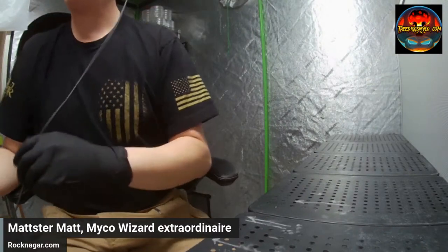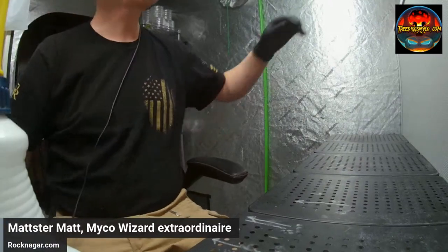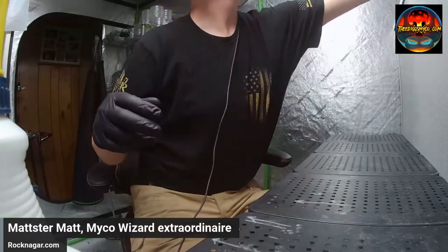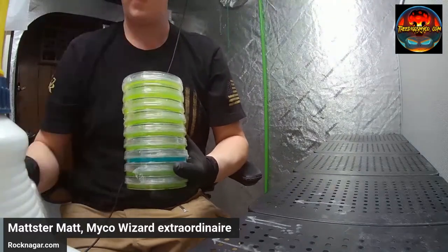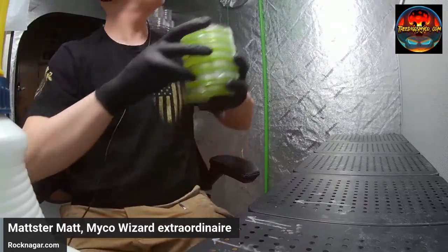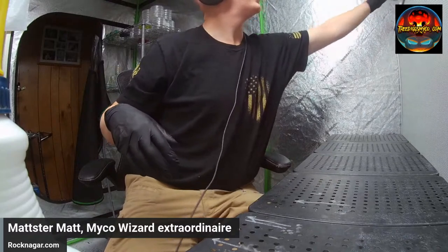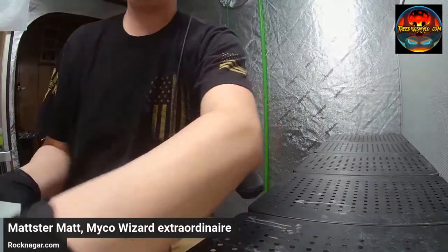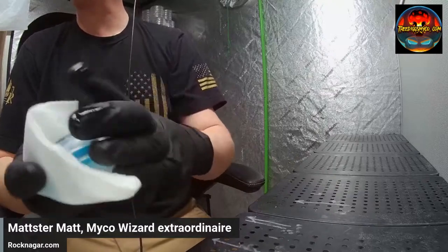All right, so we're going to go ahead and start out by doing some of the similar things we were just doing. I'm going to clean off some Petri dishes. See what we got to choose from here. We'll see how much time we get before things get moving, but we'll do at least three. So I'm not the greatest artist, so you'll see my method for cheating here to do fun stuff.